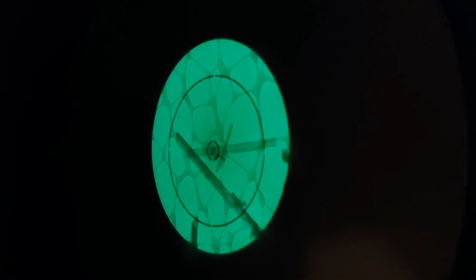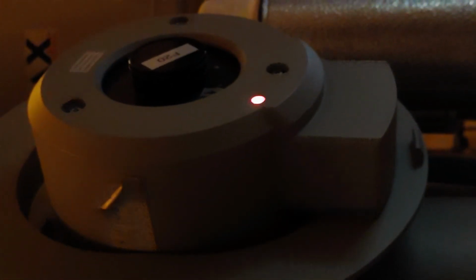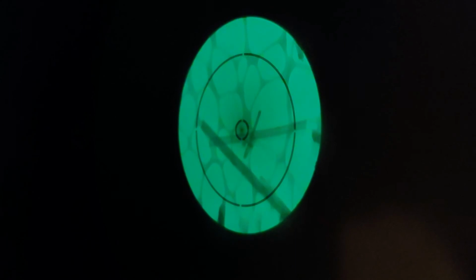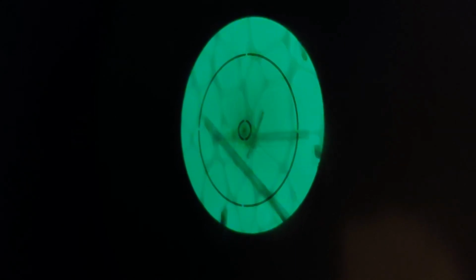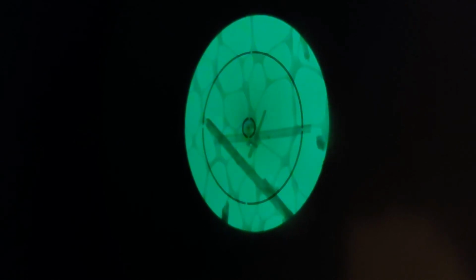Now I can wobble the goniometer. I rotate back and forth, and the specimen is rotating back and forth. And you see that the sample doesn't really move. The camera has a hard time focusing. There we go. The specimen doesn't move because it sits exactly at the rotation center. And that's where the microscope is calibrated for what's called eucentric focus, so that the two match.